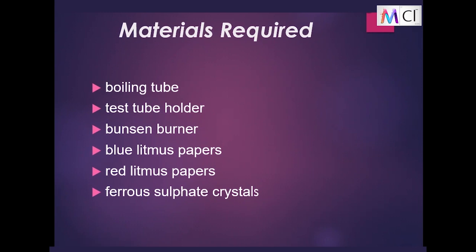Materials required: boiling tube, test tube holder, Bunsen burner, blue litmus paper, red litmus paper, ferrous sulfate crystals.